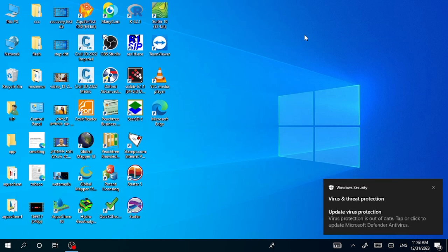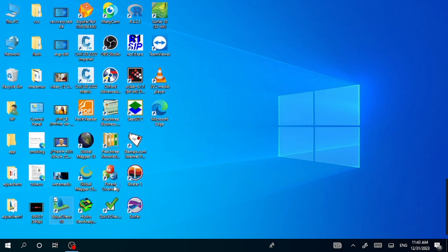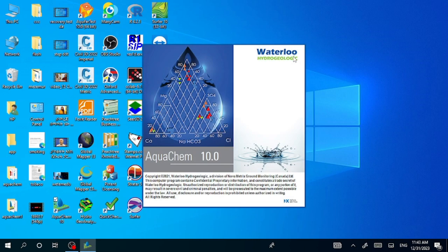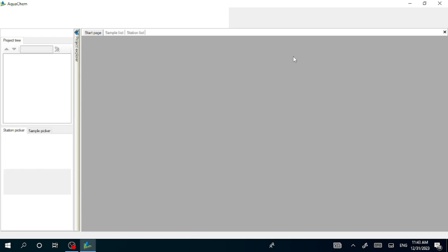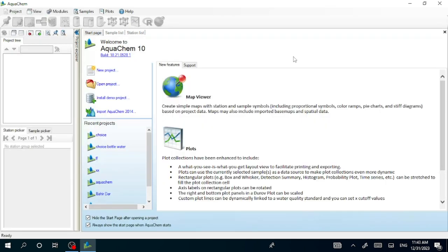Today I wanted to show you how to use AquaChem 10. It is a very important application for hydrogeologists and water quality analysis experts. I'll show you step by step how to use this application.